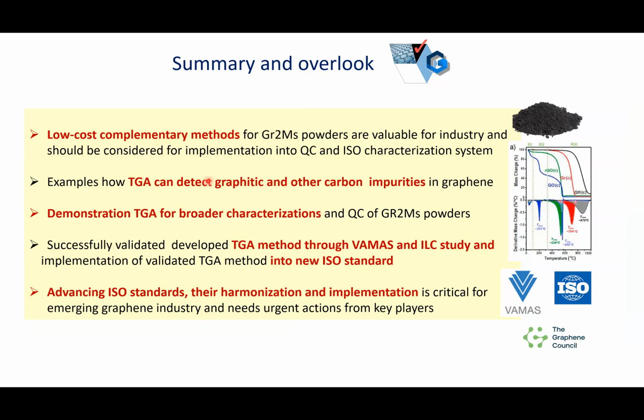I also showed several examples of the successfully demonstrated TGA method to detect fake graphene material and different carbon impurities, and also successful validation through the VAMAS program and translation into an ISO standard. A very nice story indeed.